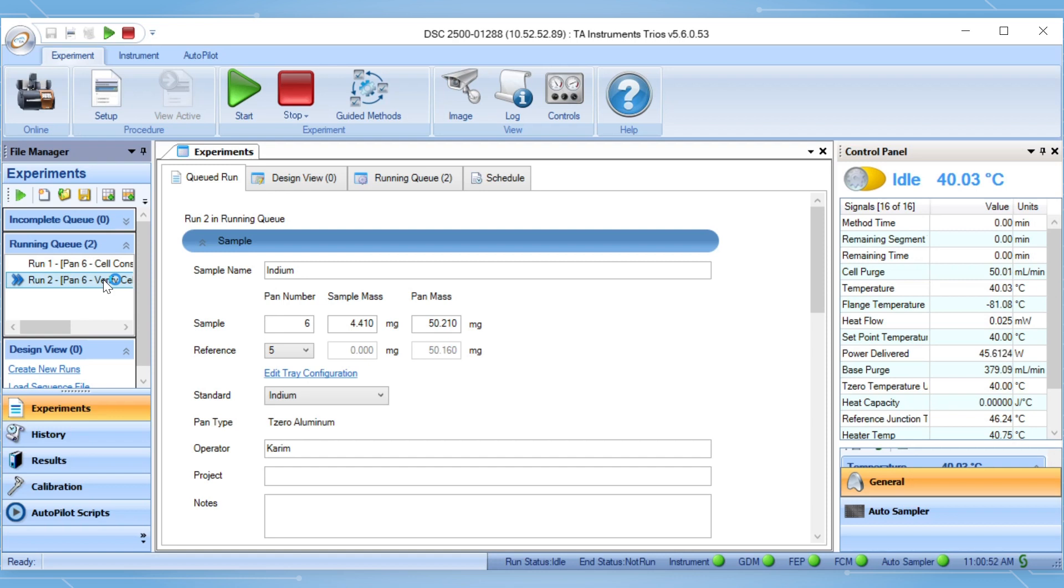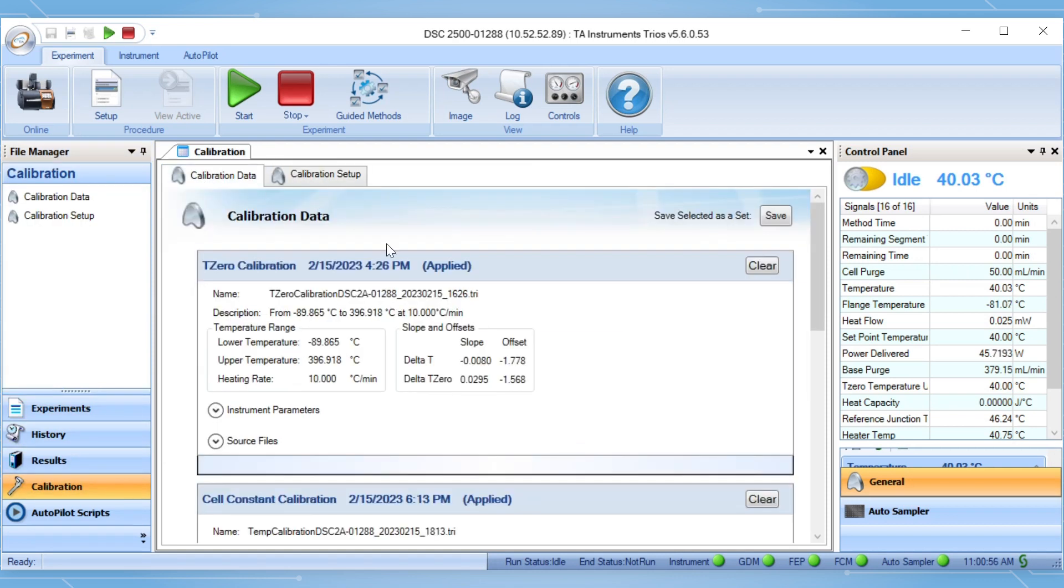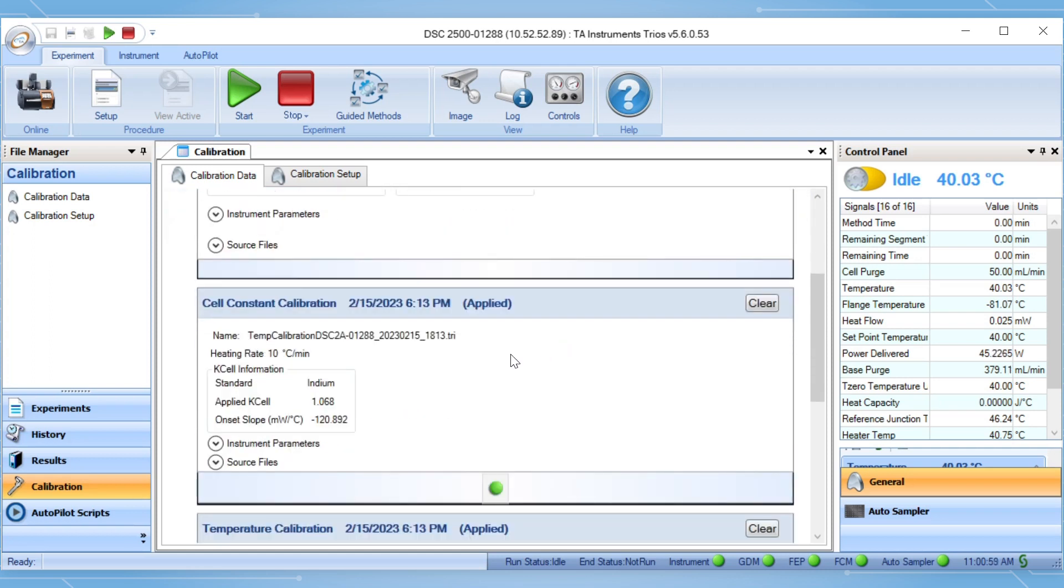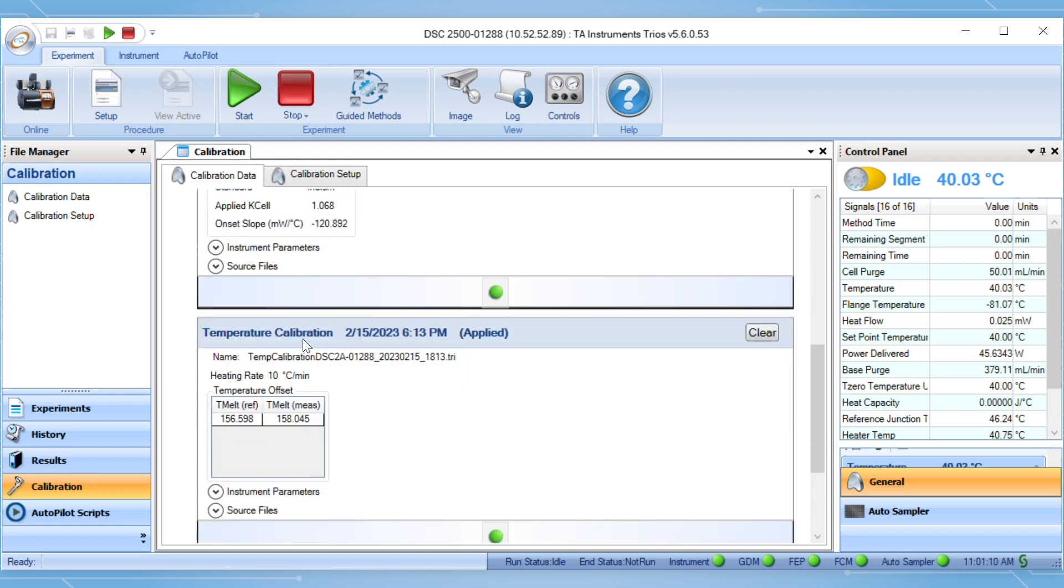Once the calibration run is done, the calibration will be applied automatically where the measured heat of fusion and onset of the melting are compared to the theoretical values. The cell constant is the ratio of the theoretical value to the measured one, while the difference between measured and theoretical melting values is used for temperature calibration.